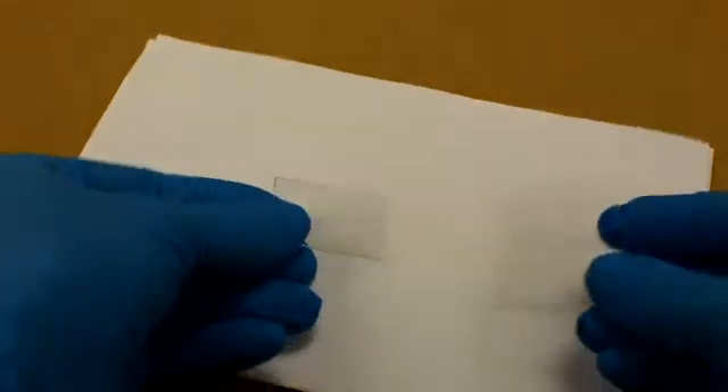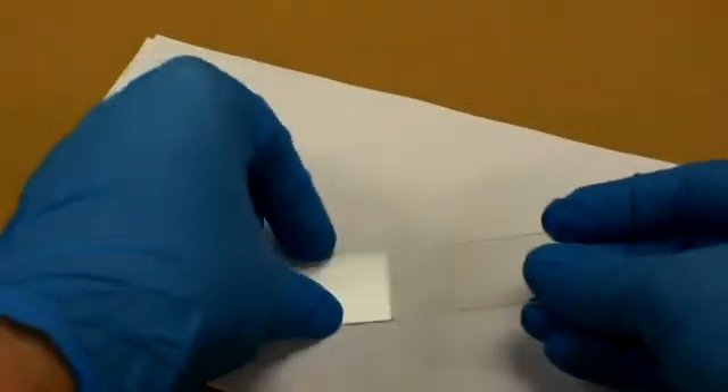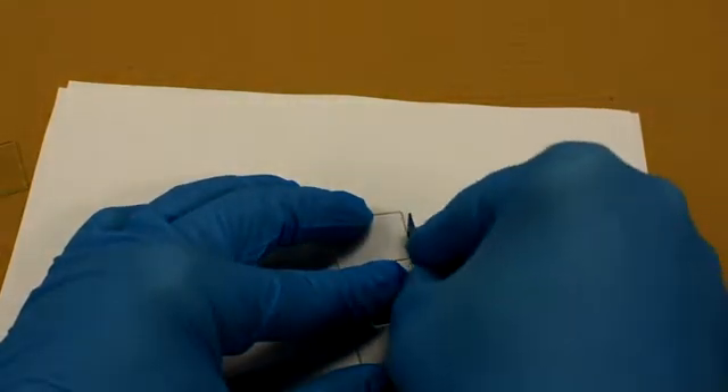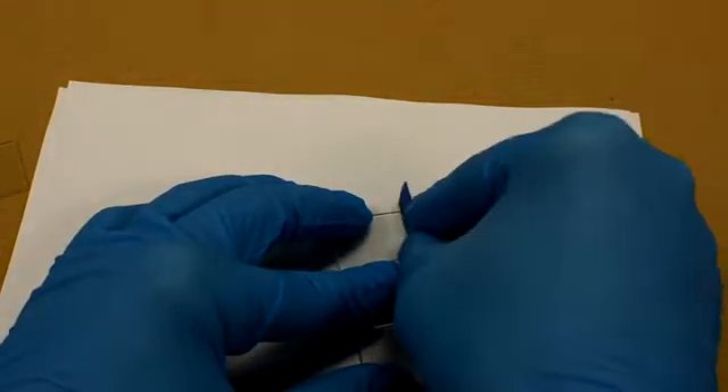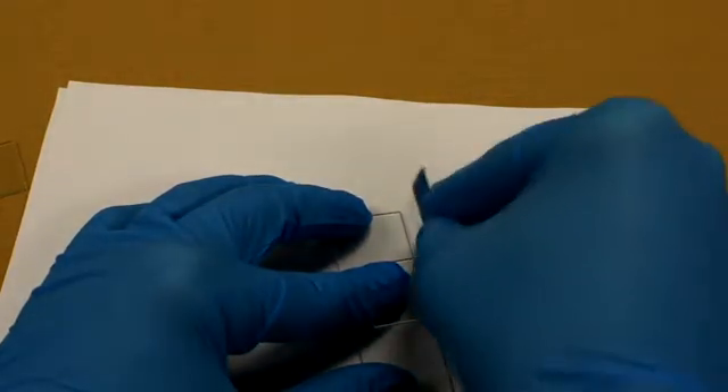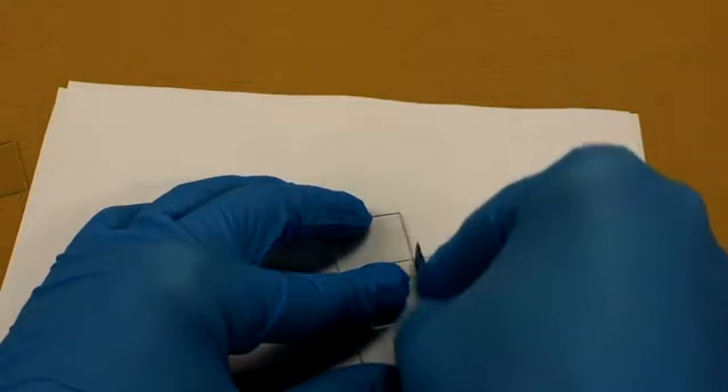We can see that demonstration one more time. Using our hacksaw blade with titanium nitride, we scribe along the glass — this is scratching the glass — putting in a stress riser so that when we apply a little bit of stress to the glass, it will fracture along that line.